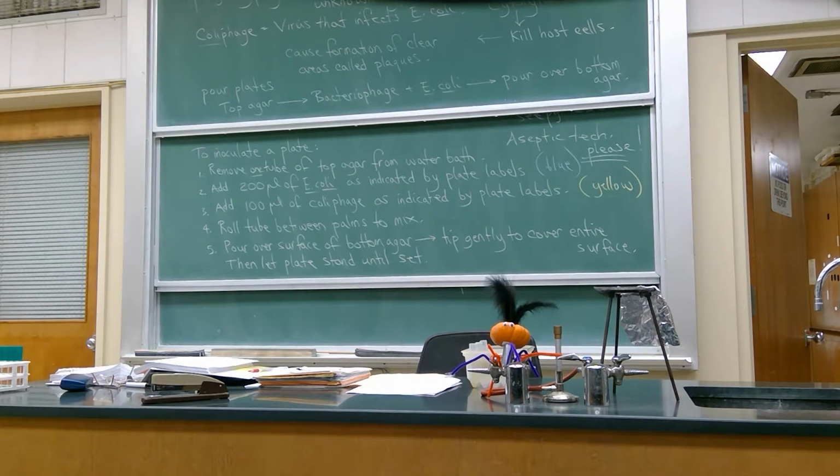I do have a question. There's an E. coli seed in your virus activity kit. It is not part of this exercise. Leave the E. coli seed alone. You're using E. coli 1, E. coli 2, and the phage, which are in the little kit and they're properly labeled. You guys should have blue pipette, yellow pipette.